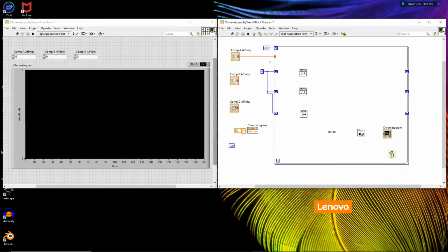Wonderful. And then flipping the page to step 18. As soon as I flip the page, you can do it, Bill. Wire the output terminal of comp B to the left edge. Okay. And I'm crossing these lines, but that's fine. And then how about comp C? Do the exact same thing. So A, B, and C. Wonderful. Wire the output terminal of the top shift register to the top input terminal of your first mover function.